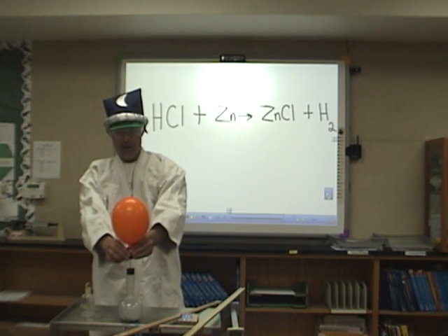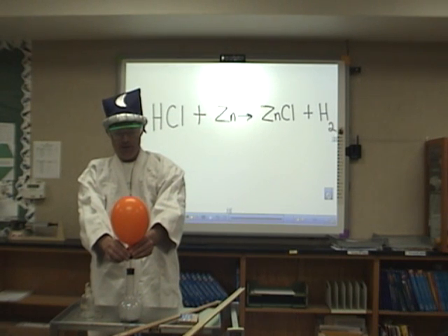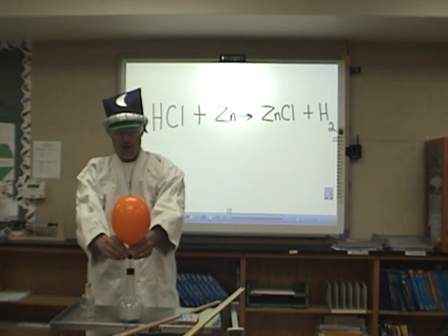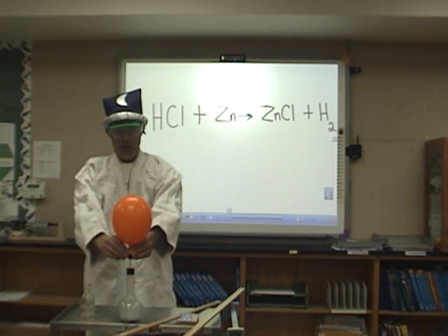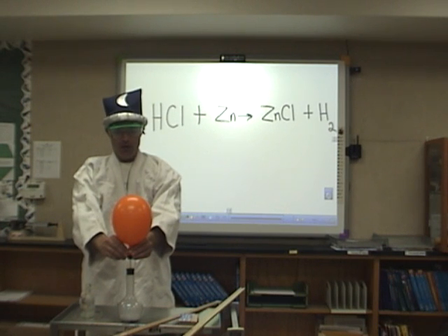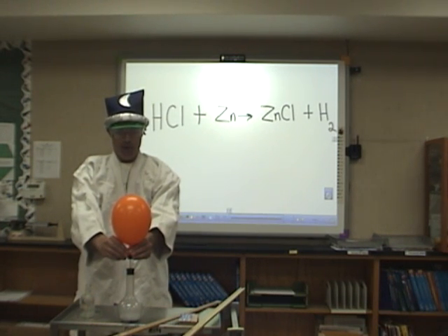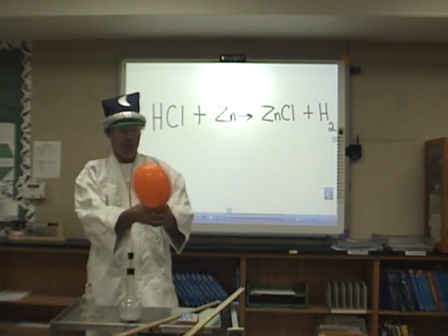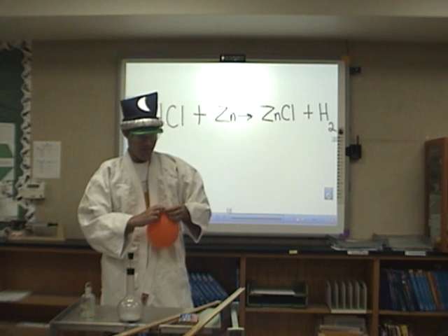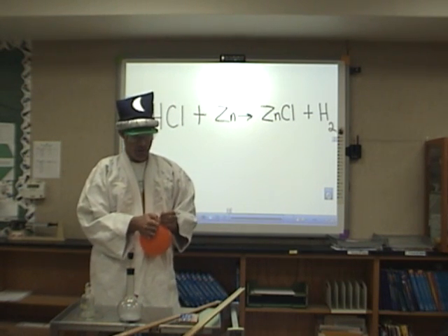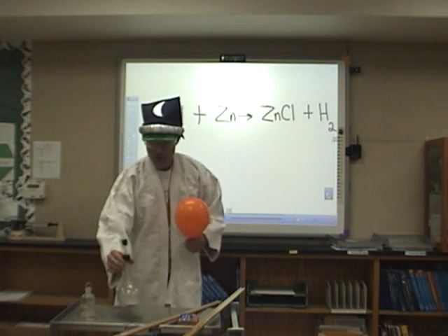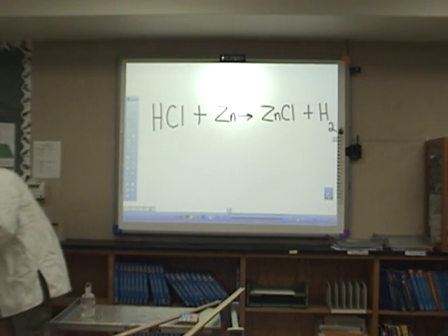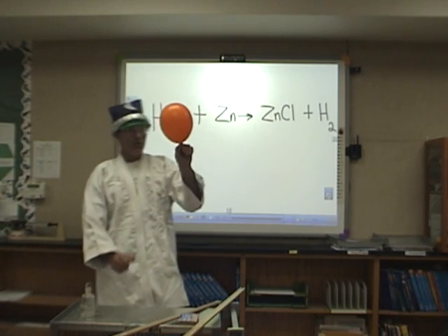That's filling up very nicely. Plenty of hydrogen gas in there. You can also notice the reaction behind me is a single replacement reaction. One element is replacing the other, changing hydrochloric acid from its state into zinc chloride where zinc has replaced the hydrogen, and hydrogen is all by itself as a diatomic molecule. We have plenty of hydrogen in here, and I'm going to move the Florence flask out of the way. Here we go, our balloon of hydrogen gas.